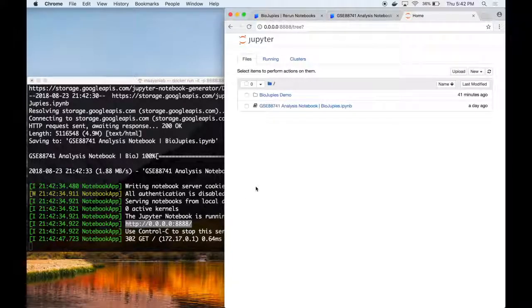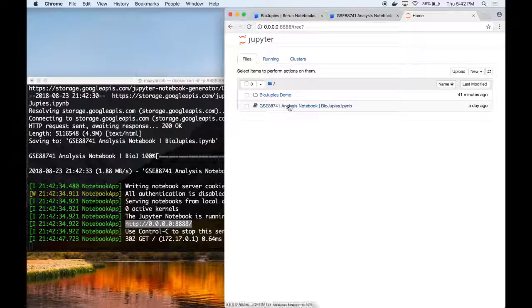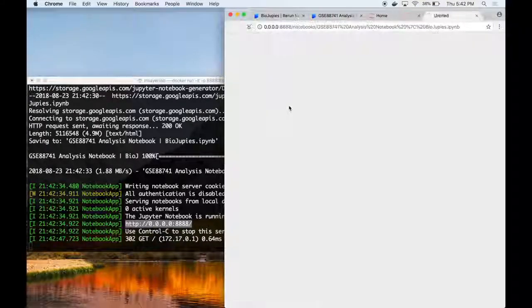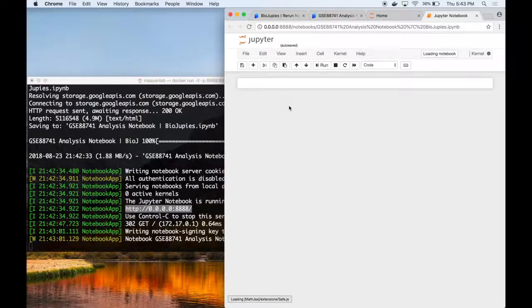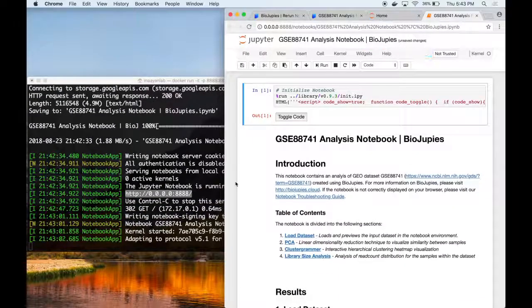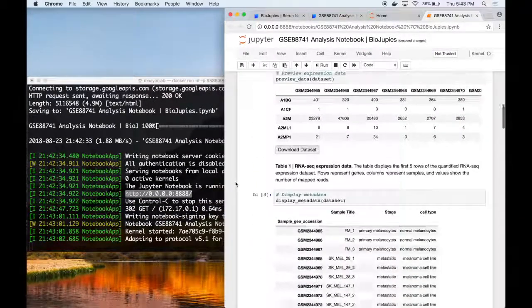The browser now gives us access to our running Jupyter server containing the notebook we wish to analyze. By clicking on the notebook's name, we can access the notebook itself and run all the code cells contained within the notebook.